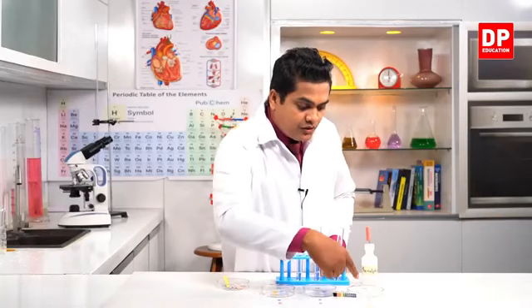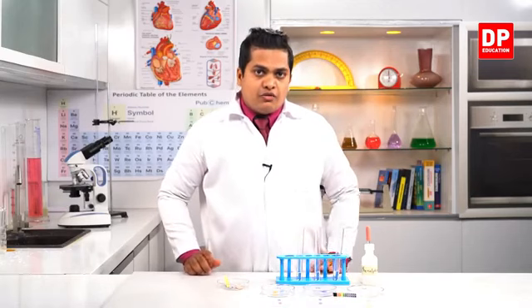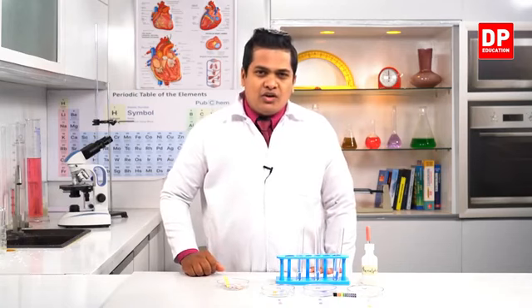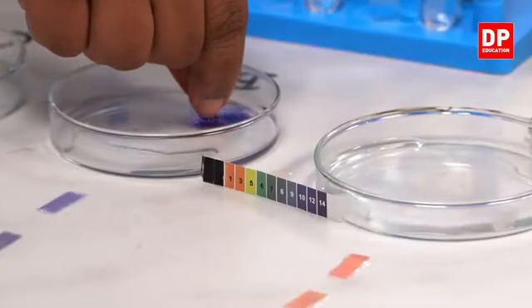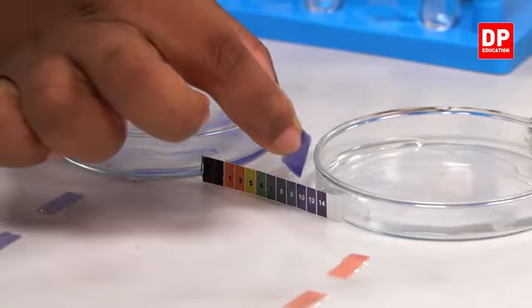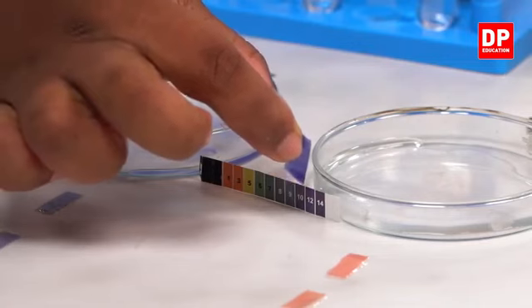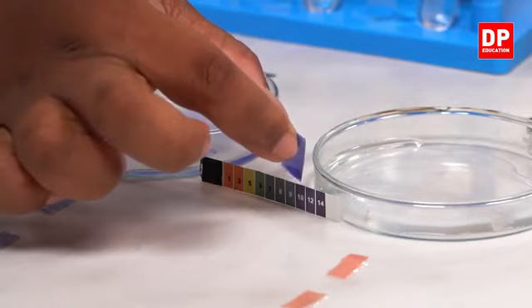So in the first solution, where we use hydrochloric acid, the pH value is about 2 and it is showing a red related color, like an orangish yellow kind of color, right? So the second one, sodium hydroxide solution with pH paper. See, it is showing a good blue color. See, the pH value is about 9 or 10. It's showing a good blue color.